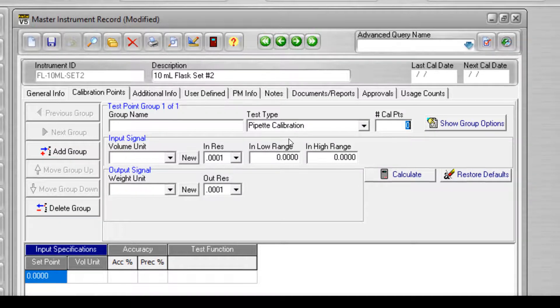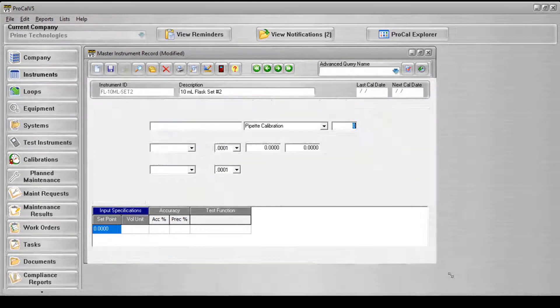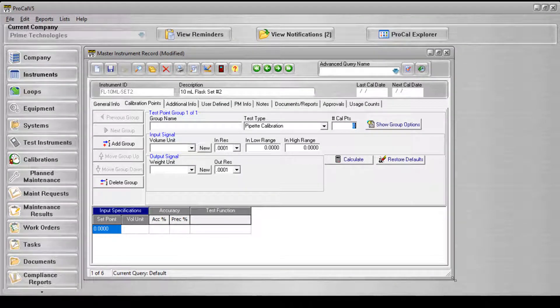It's important to note that the Calculate and Restore Default buttons are present but not active. The conversion between mass and volume will be calculated outside of the test type package, but the test type package will calculate the accuracy and precision values at each test point.